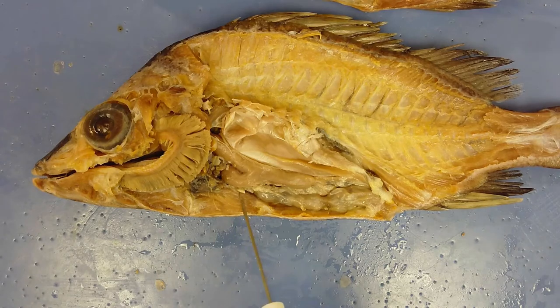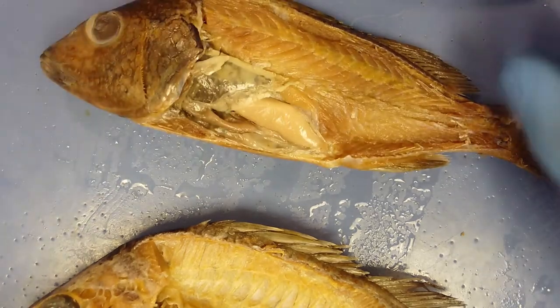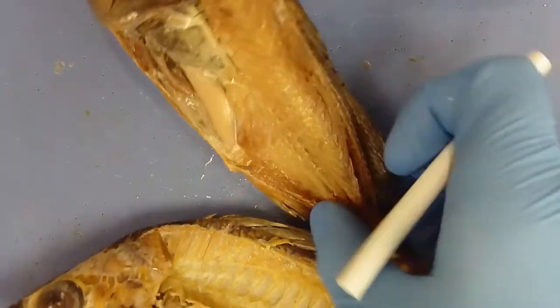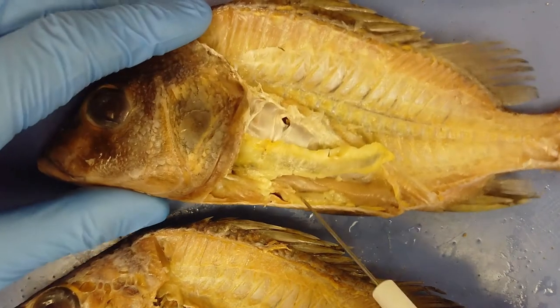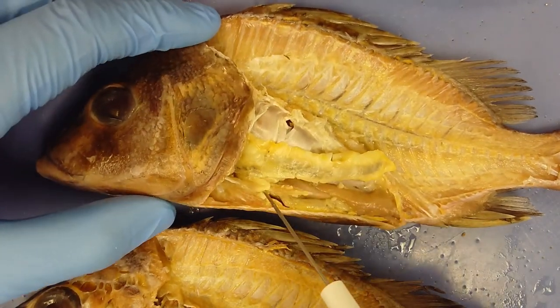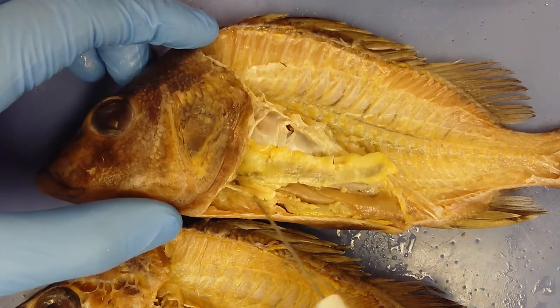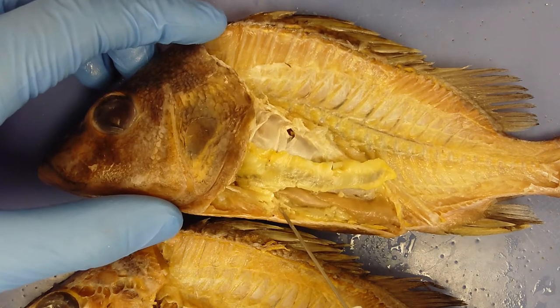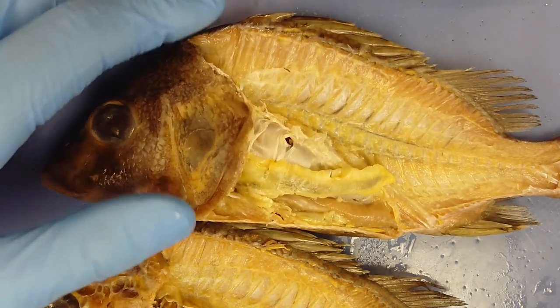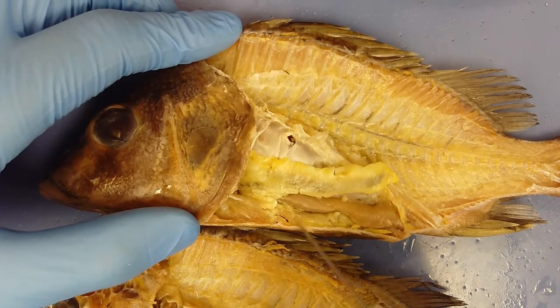What has been removed in this specimen are the pyloric caeca — these are thin tubes with small yellow material wrapped around them. They create digestive enzymes and increase the surface area of the intestine, making them multifunctional.